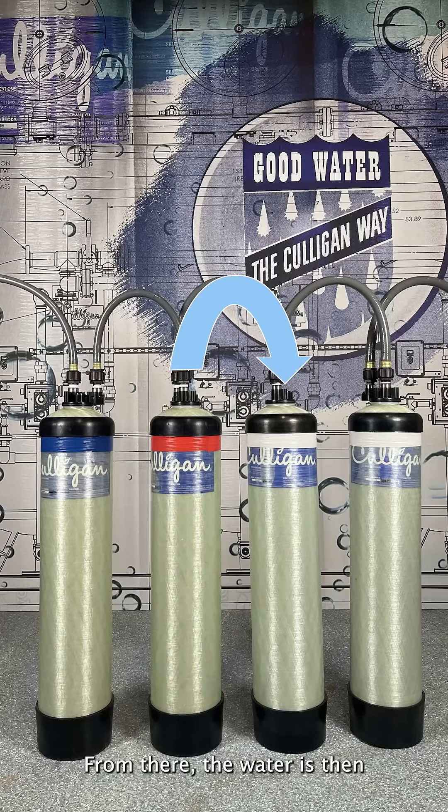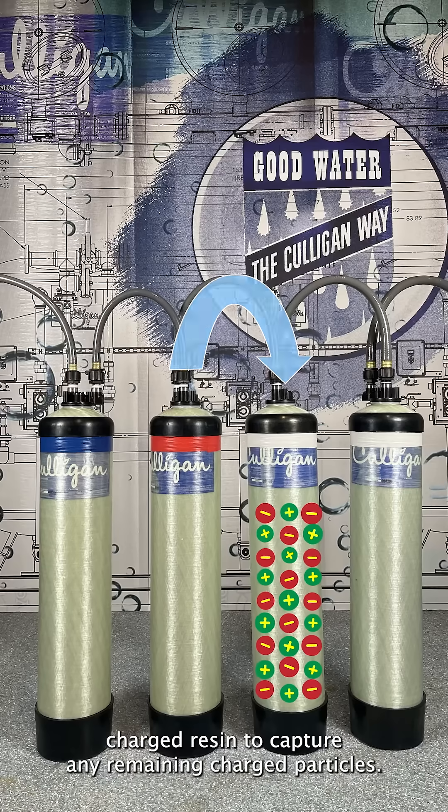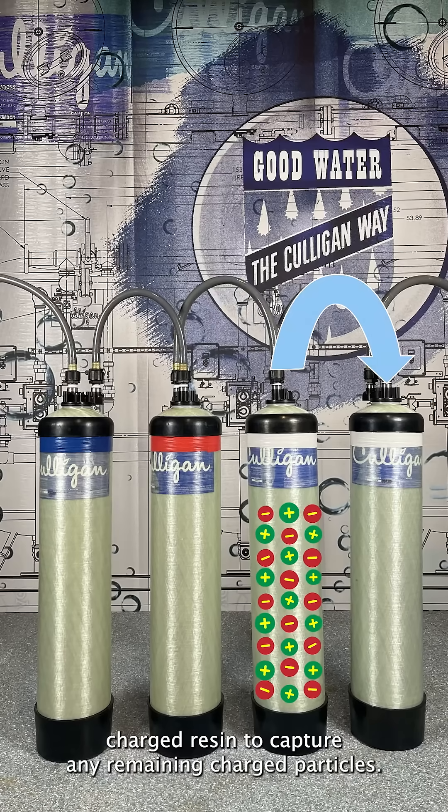From there, the water is then introduced to a mixed bed of both positively and negatively charged resin to capture any remaining charged particles.